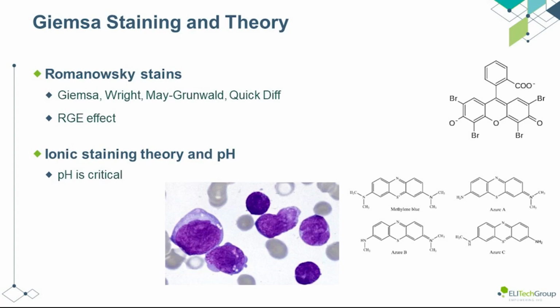In general, stains act by binding to components within the cell, usually through ionic bonding, but other methods of binding are also utilized. Eosin is a negatively charged dye, while methylene blue and azure can hold a positive charge. When these dyes come together in the nucleus, you see what is known as a Romanowsky-Giemsa effect, which is a characteristic purple color only present in the nuclei and neutrophil granules. This purple effect may be lessened in single solution dyes with high methanol content.